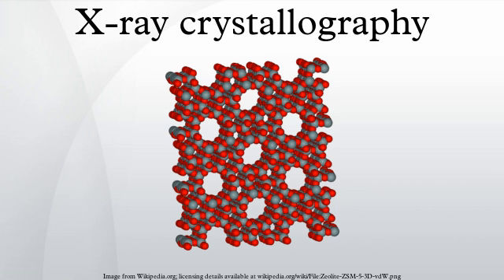Optimizing the intensity scale is critical because the relative intensity of the peaks is the key information from which the structure is determined. The repetitive technique of crystallographic data collection and the often high symmetry of crystalline materials cause the diffractometer to record many symmetry-equivalent reflections multiple times. This allows calculating the symmetry-related R factor, a reliability index based upon how similar are the measured intensities of symmetry-equivalent reflections, thus assessing the quality of the data.